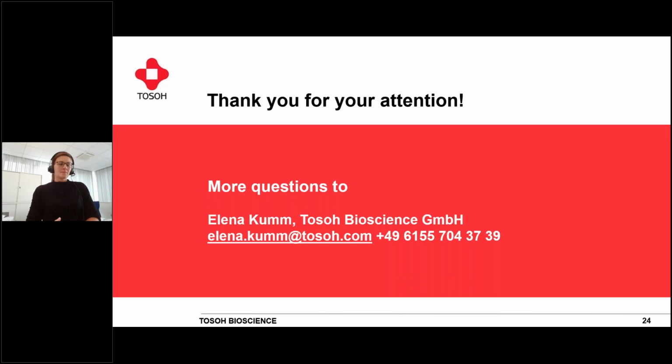So there's then one. Obviously the focus has been on quite large proteins for this talk, but there is a question here on, is there a method, or recommendation, I guess, for small peptide purification?